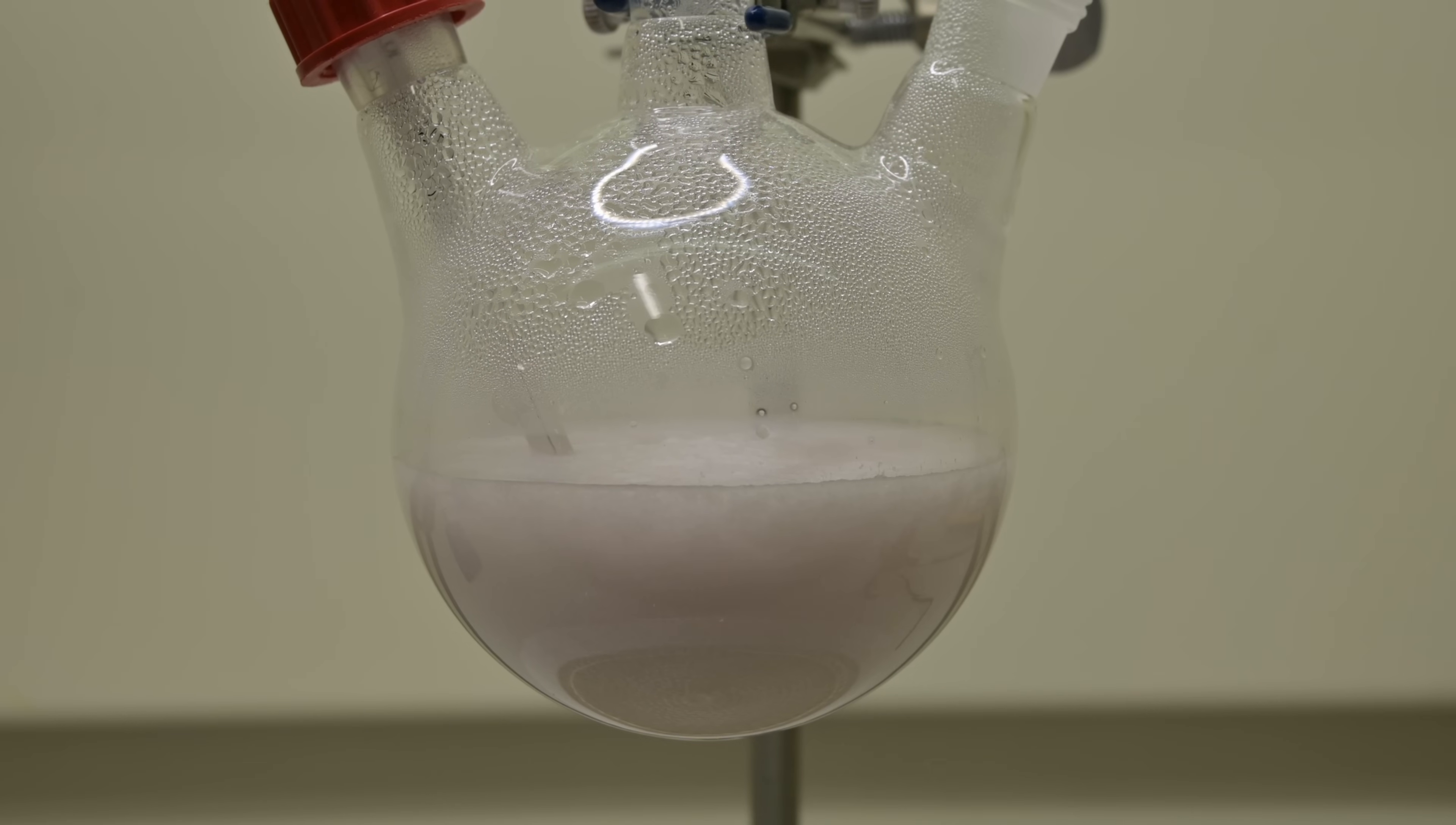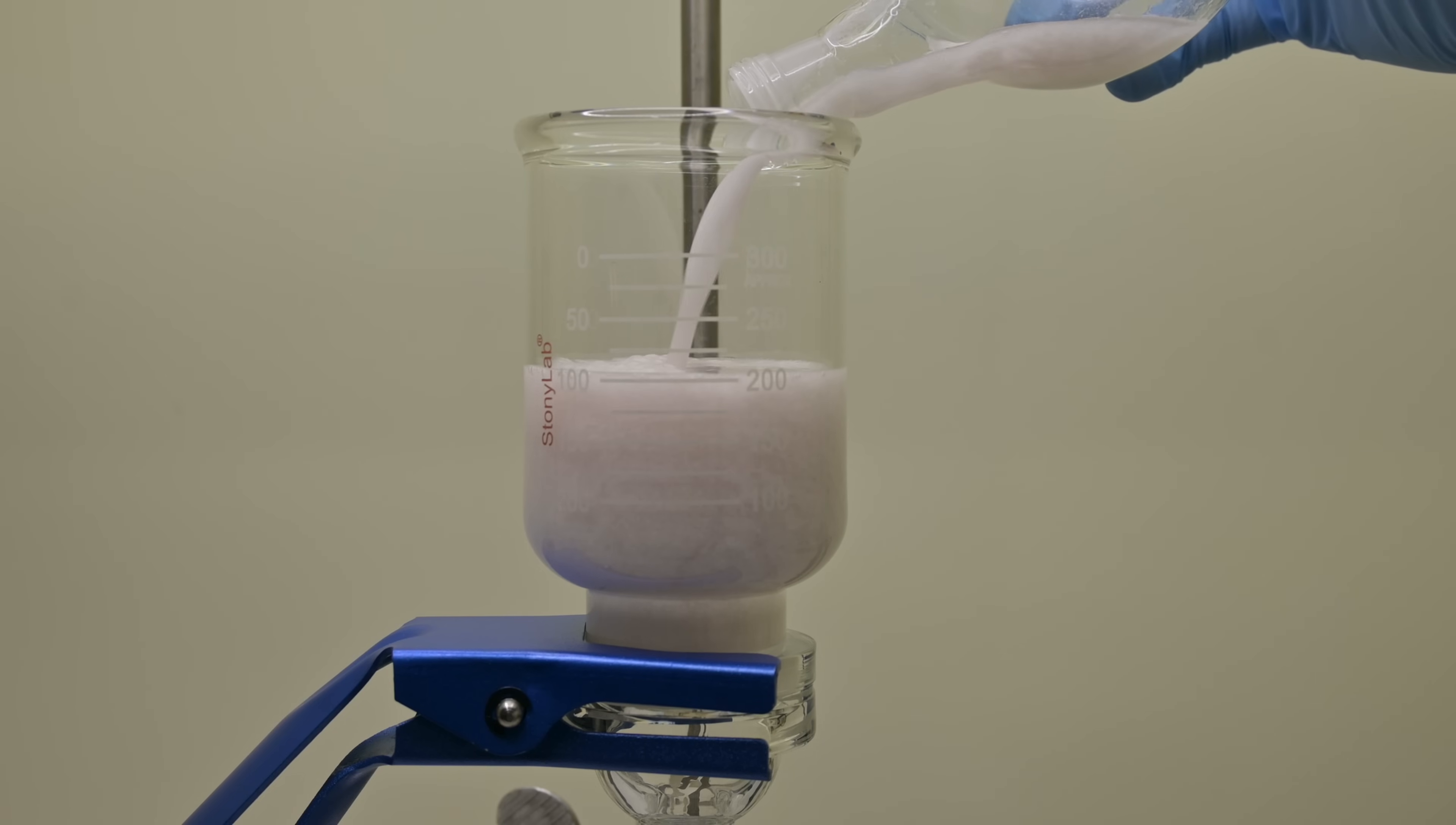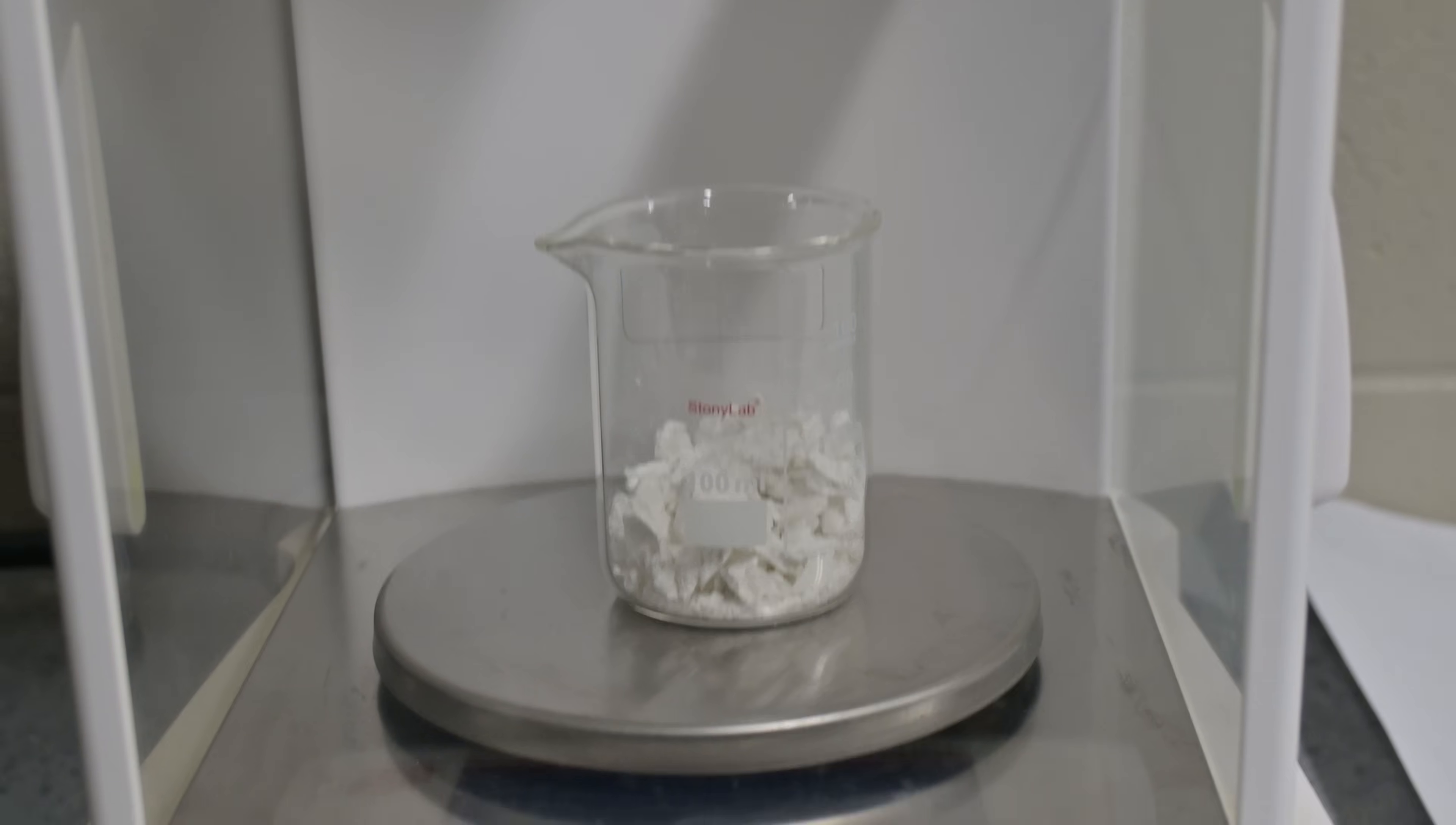To make sure all our product is out of solution, I place the flask into an ice bath. The colder temperature reduces solubility and helps our product, p-acetotoluidide, crystallize out of solution. Once the crystals have fully formed, I collect them using vacuum filtration. I rinse them with cold water to remove any residual sodium acetate or acetic acid that might be clinging to the crystals. Then I place the filter cake onto a watch glass and dry it overnight. My final yield is about 6.1 grams.